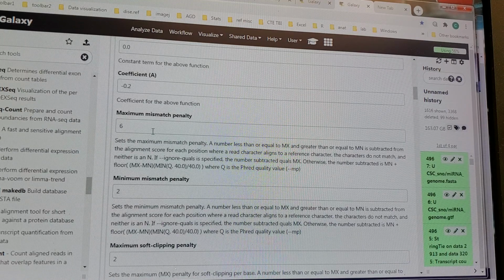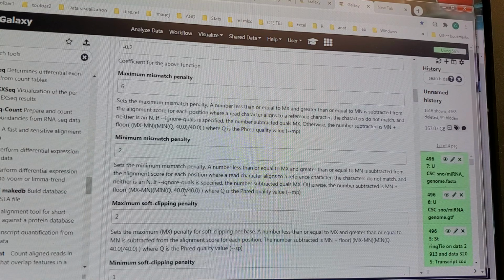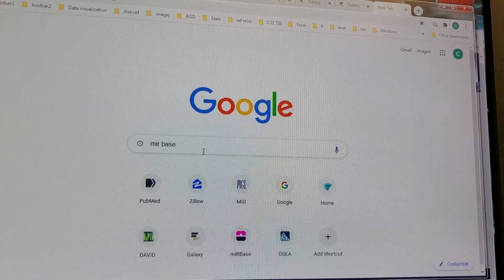But if you find something that you think is important and you just don't know, is this value right? There are two ways to approach that: test different values. So test 6, then test 0, then test 20, and see how it changes things. It might change them a lot, it might not. You want to go through anything you think is important after reading about it and test it for yourself.